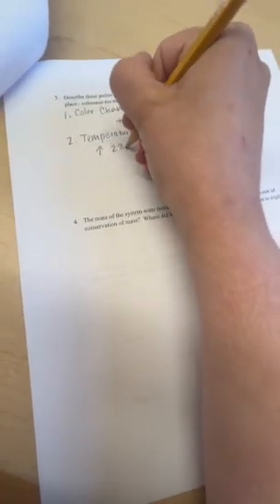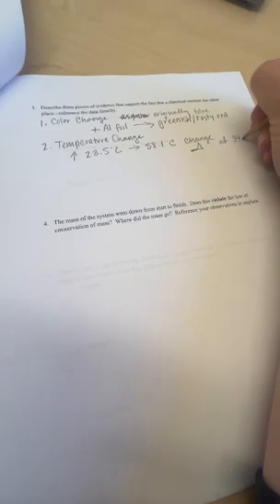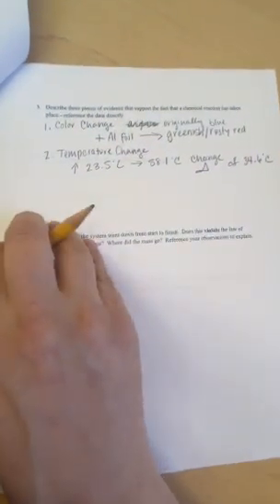So our temperature increased from 23.5 degrees Celsius to 58.1 degrees Celsius. So we had a change of 34.6 degrees Celsius here. So that is another indicator of this chemical change.